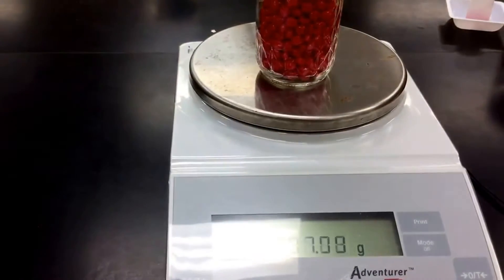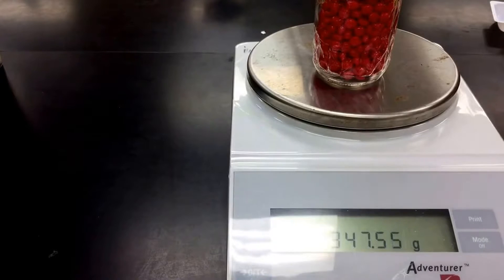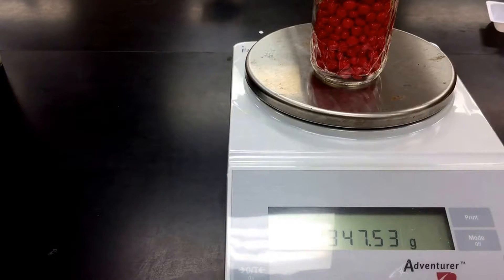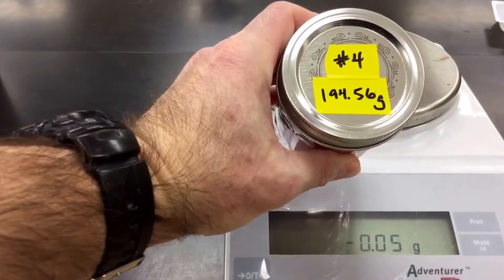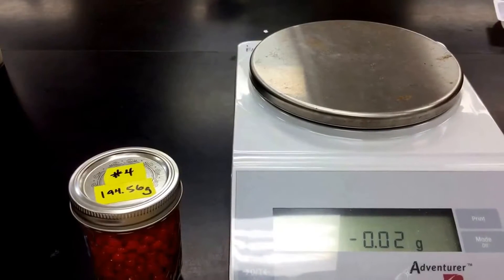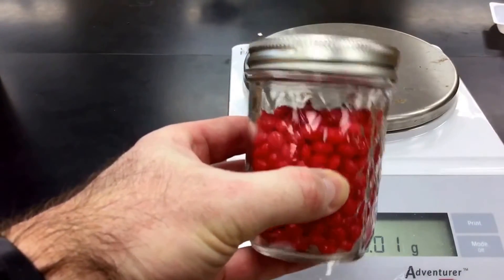Then we want to weigh this. It's a little hard to see here, but it says 347.56. So that's the mass of your full jar. And what we're going to do is subtract the mass of our empty jar, which again was 194.56. So you're going to subtract those two numbers, and that's going to tell you the mass of all the red hots that are in this jar.